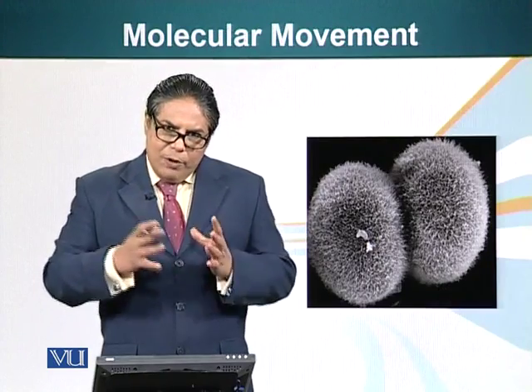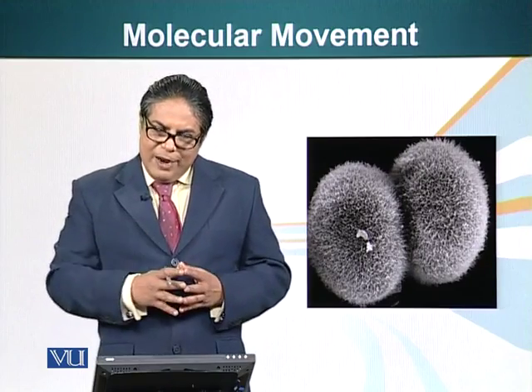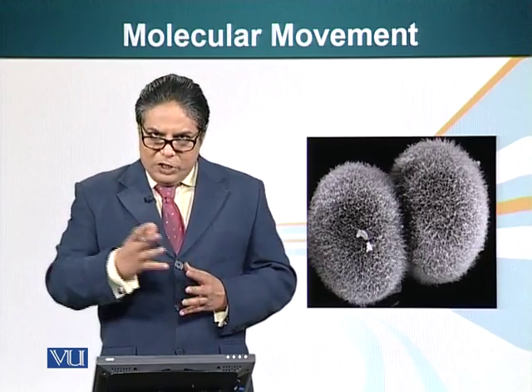In lab, you will be shown different slides, and you'll be asked to identify different phases of cell division on that slide.